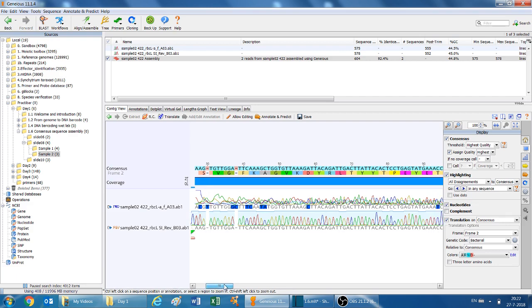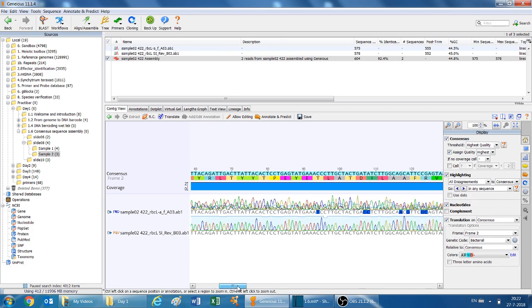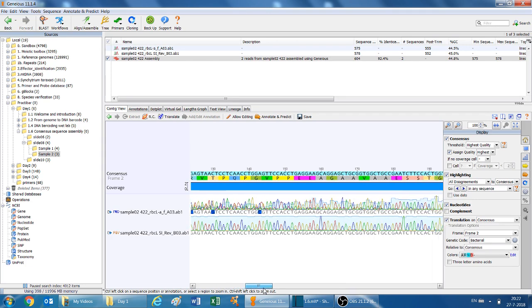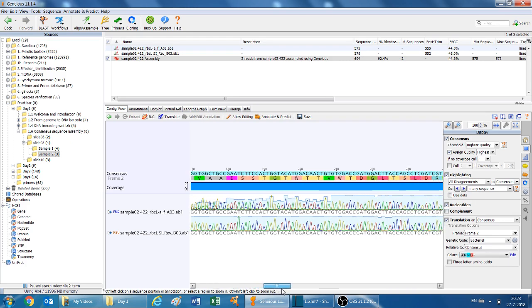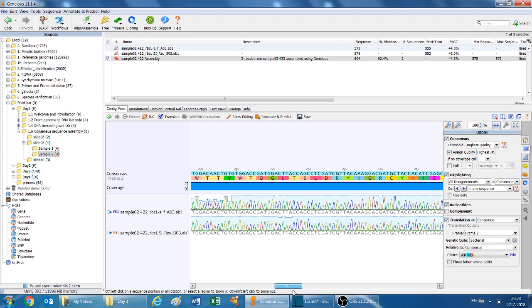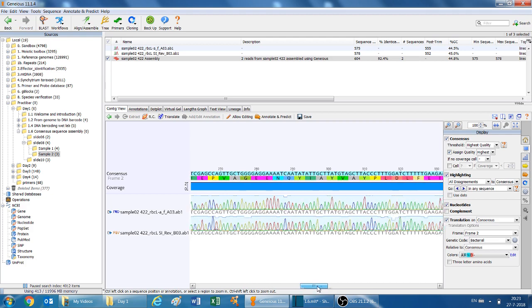But for the stretch where the sequence data in the above read is really poor, we meticulously look at the electropherograms of the bottom read, and actually that looks really nice. Spacing is nice, nice peaks, equal height, good Phred scores, so this looks really nice. And now we came into a stretch where we do have good sequence data in both reads.